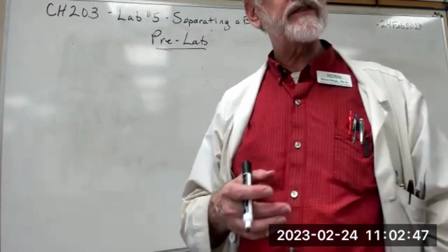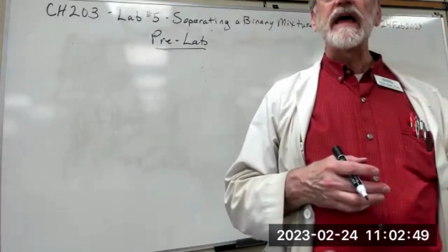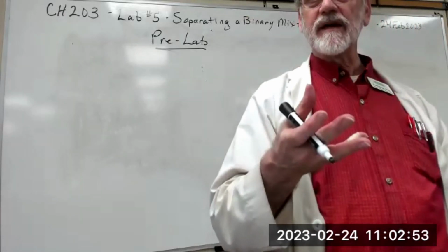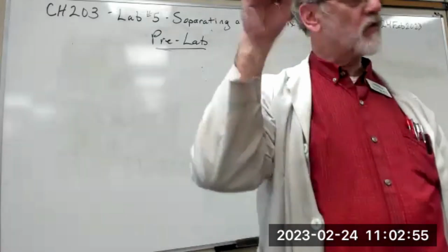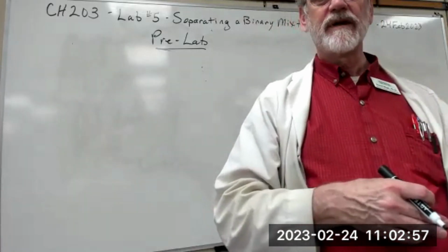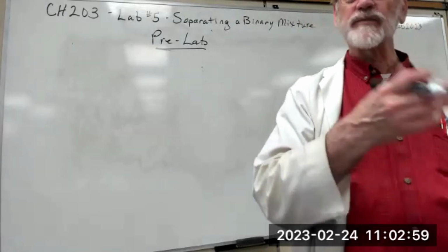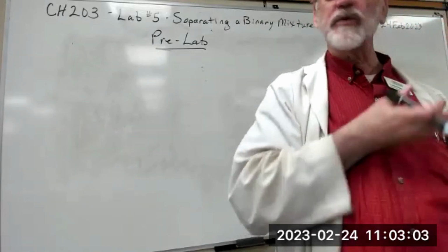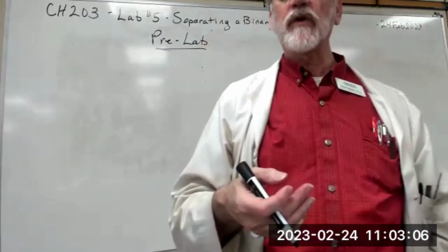If you've got something in solution, then the solution has something dissolved in it, and if the particles are small enough, they'll go right through the filter. And anything that didn't dissolve or has particles big enough for the filter paper will get caught in the filter paper. It's purely physical separation.